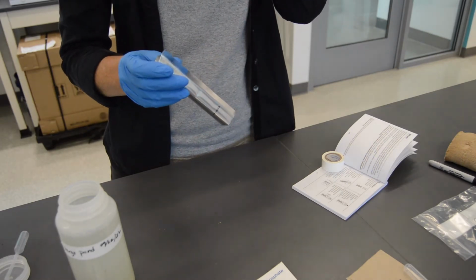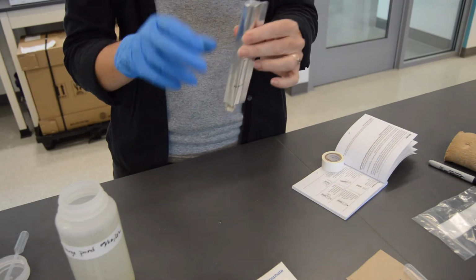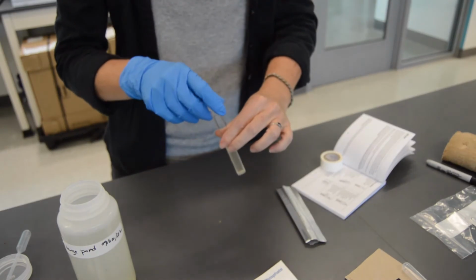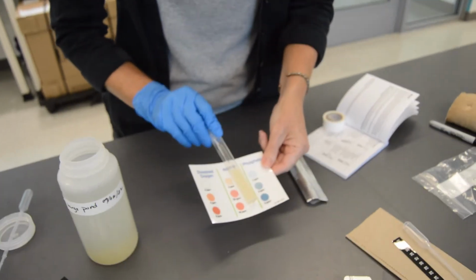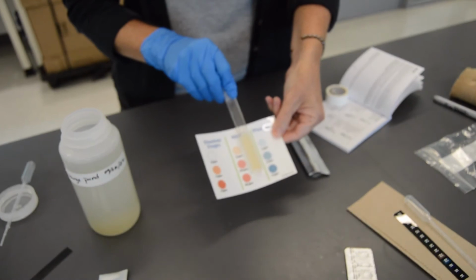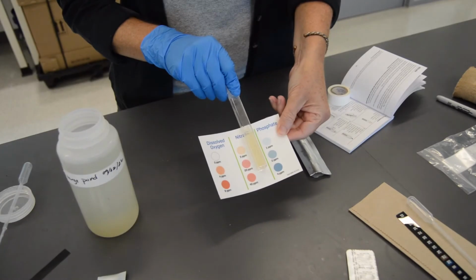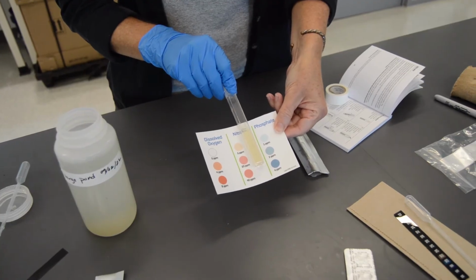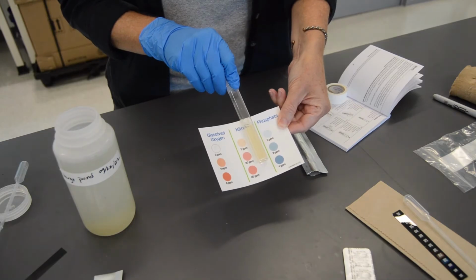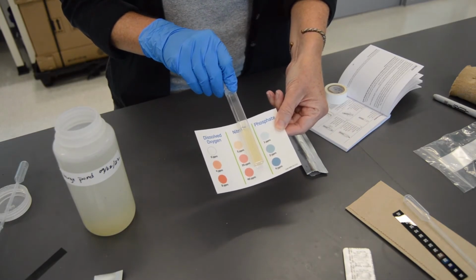So we dissolved our tablet by shaking it for about 2 minutes, and then we waited for 5 minutes so that the color could develop for the nitrate test. And what we see is actually what we want to see: the yellow color is mostly from the pond water. It's a little bit yellow, but we really don't have a significant pink tint at all. And even if we do, we're well below the 5 ppm, and having any nitrate is not really good. So we want to be below 5 ppm.